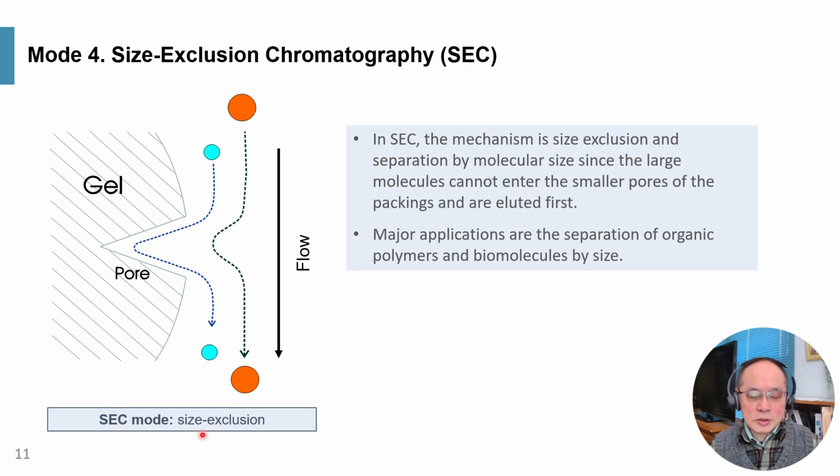So the mode is called size exclusion, separation by molecular size, since the larger molecules cannot enter the smaller pores of the packings and are eluted first.